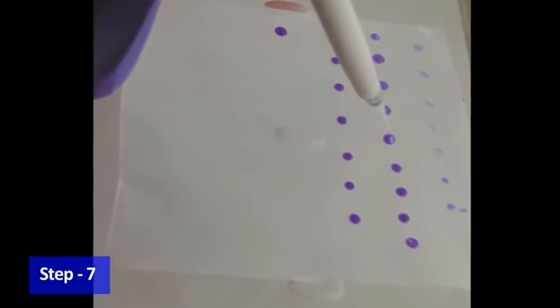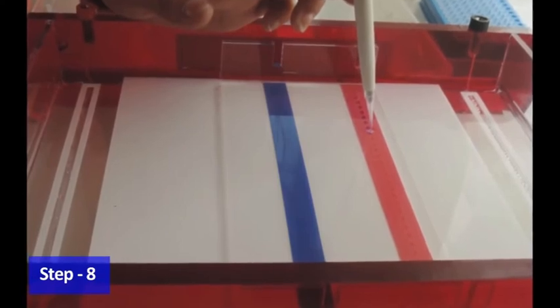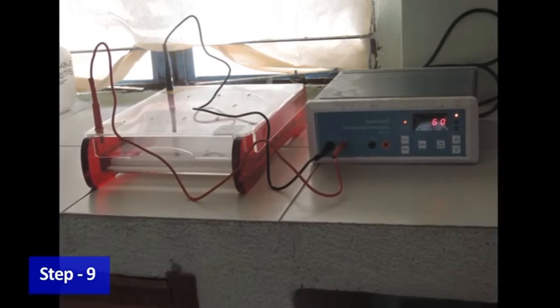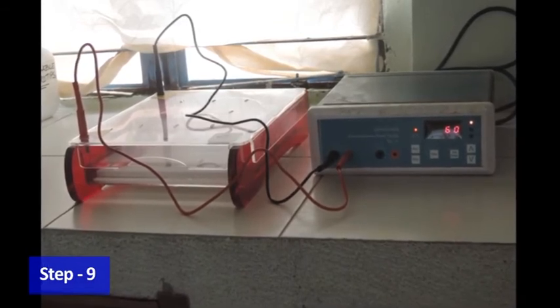Now mix 10 microliter of DNA with 10 microliter of loading buffer and load it into the well. Mix 5 microliter of loading buffer with 2 microliter of ladder and load it in another well. Now run the gel at 100 volt for 20 minutes or until the dye line is approximately 75 to 80% of the way down the gel. Now place the gel on the tray of a transilluminator and photograph the picture.